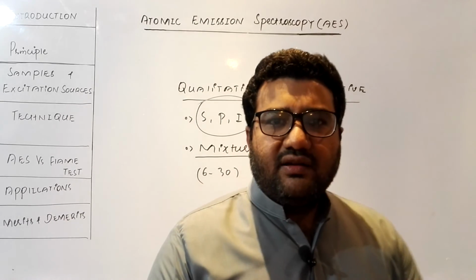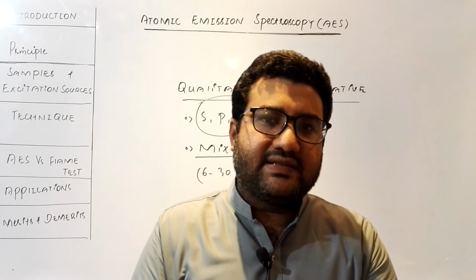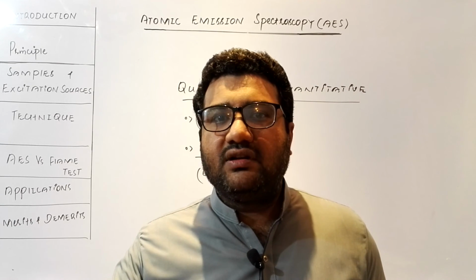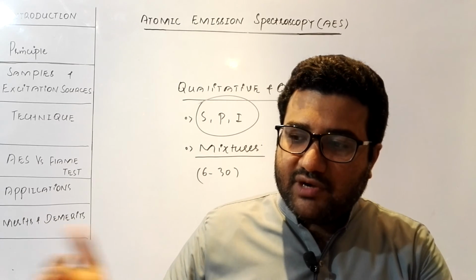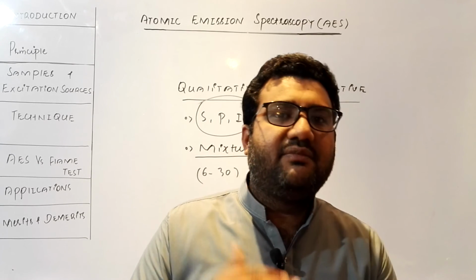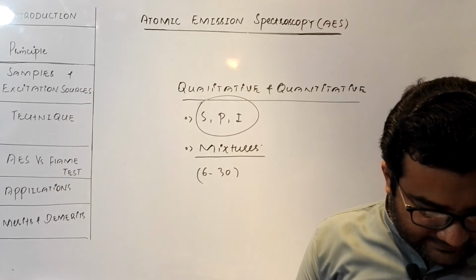Let me tell you how the atomic emission spectrum of mixtures will be studied. When there is a mixture, the atomic emission spectrum will be very complex. But we will compare the atomic emission spectrum of the mixture with the individual atomic emission spectrums of the different elements. Then by looking at the arrangement of the spectral lines, we can easily identify what different types of elements are present in a mixture. So we can also judge the 6 to 30 elements.